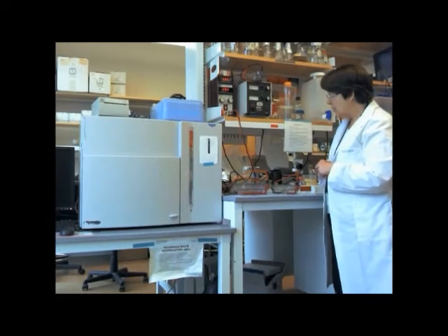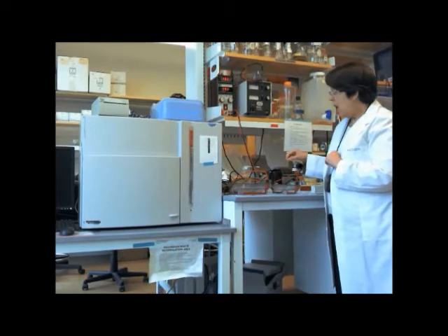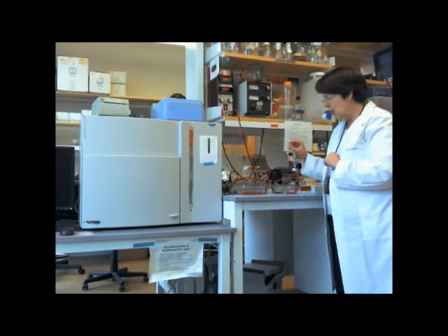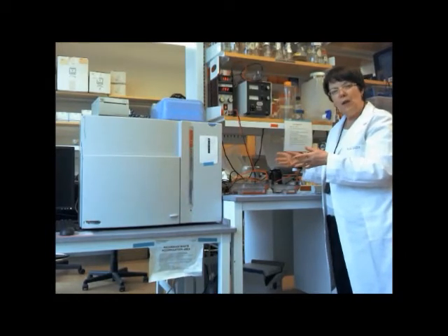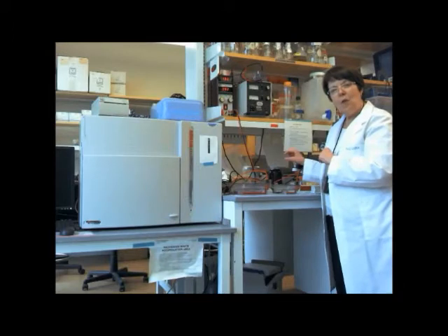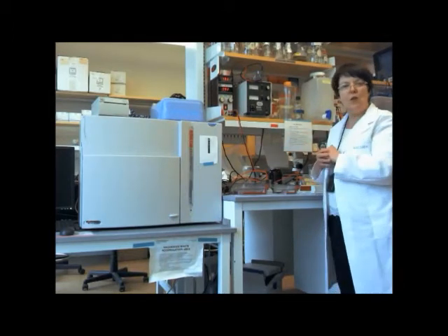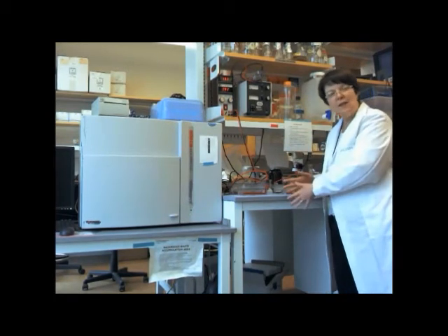And the third question, when I have you load your samples, the sample will sink to the bottom of the little space, the little well, and not mix with the water. So I'd like you to find out why the sample sinks and doesn't get diluted into all of the buffer and volume of the gel. So why does the sample sink?